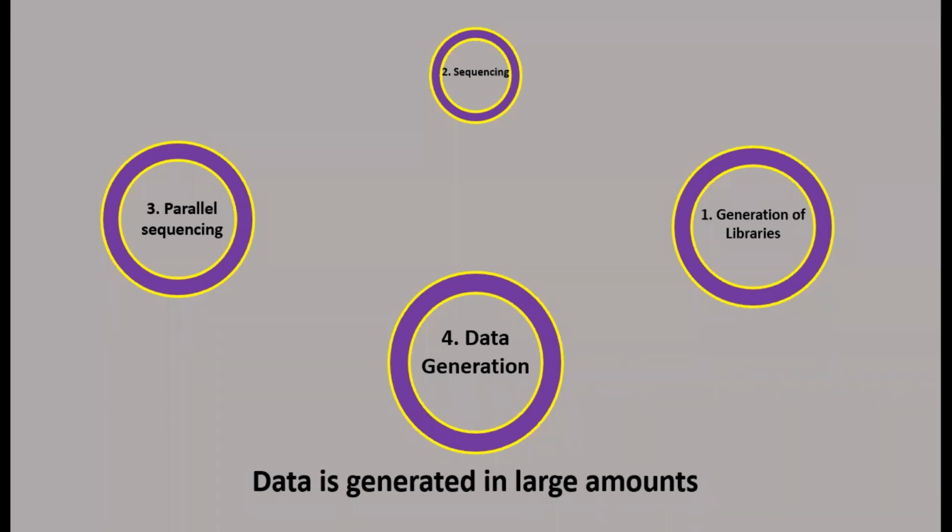So that is how NGS is providing an edge over the others, at step number 3, that it is providing you a parallel sequencing platform, whereby simultaneously you are sequencing as well as segregating the DNA of interest and amplifying it as well, right? That is how you can actually use NGS for your own preference or your own advantage. And finally, you will get your DNA data generation. And once your data generation is happening, you can just go for your final analysis using the online servers which are provided there, right?